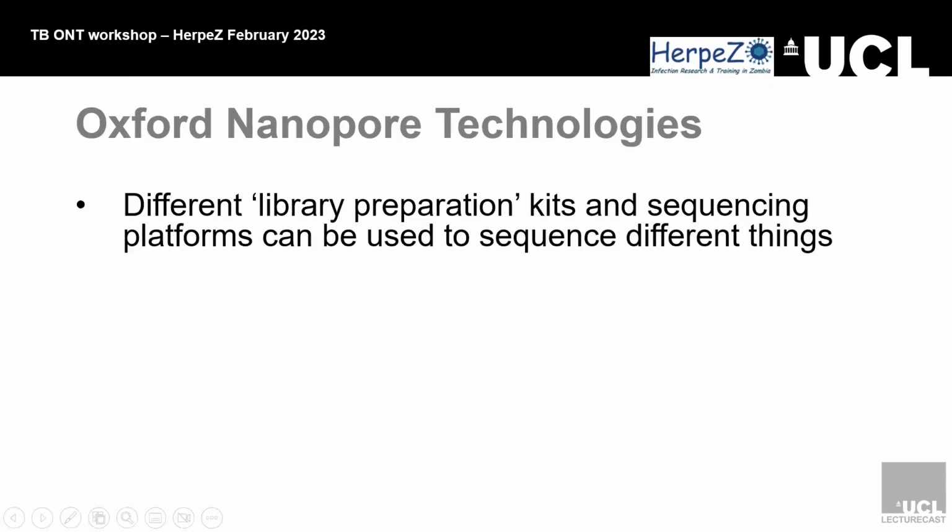So the difference between nanopore technology and Sanger and Illumina is that Sanger and Illumina is sequencing by synthesis. They are actively adding DNA to the strand you want to find out about. Whereas with Nanopore, you are purely sequencing that strand specifically.